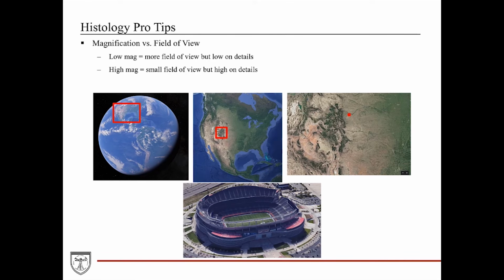So a super duper detailed structure may not be quite as informative when studying histology. That is, unless you become an expert and can recognize a lot of characteristic structures of different organs. Regardless, the best practice in observing tissues is to always start with a low magnification image, then incrementally go into higher magnification in order to always have the contextual information in mind.